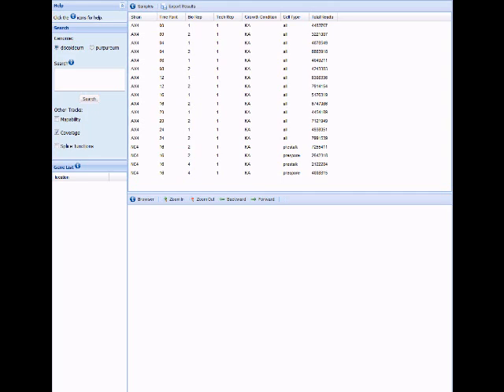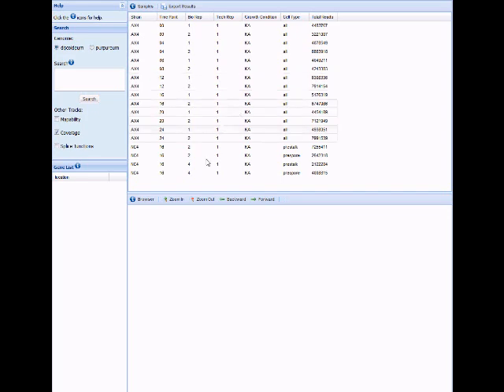This is the initial view of the browser, and you can see four main panels: the search panel, the gene list panel, the samples panel, and the browser panel.